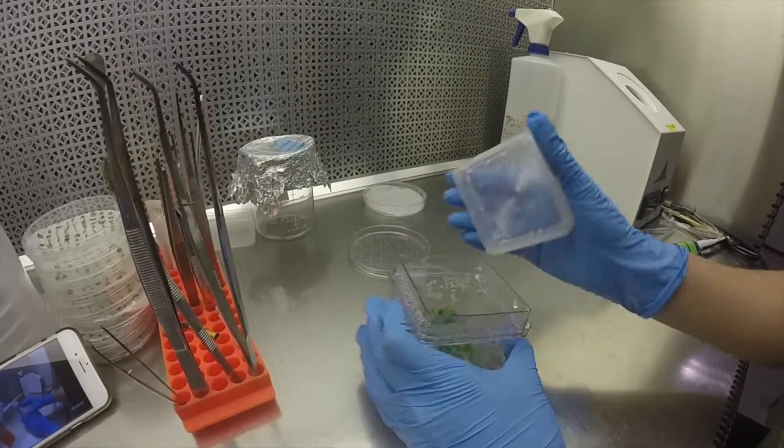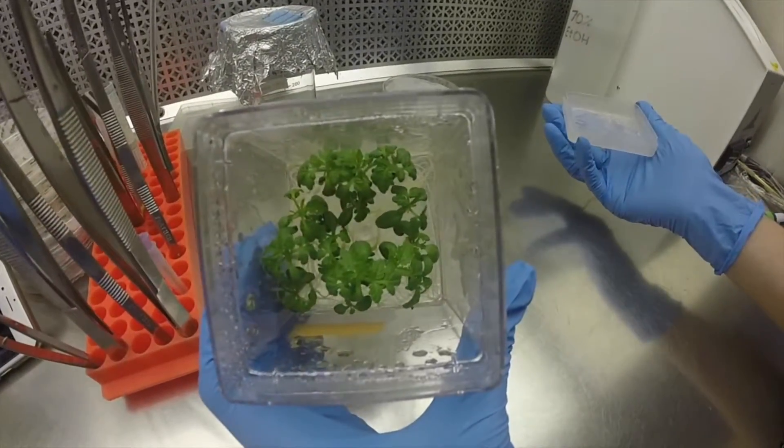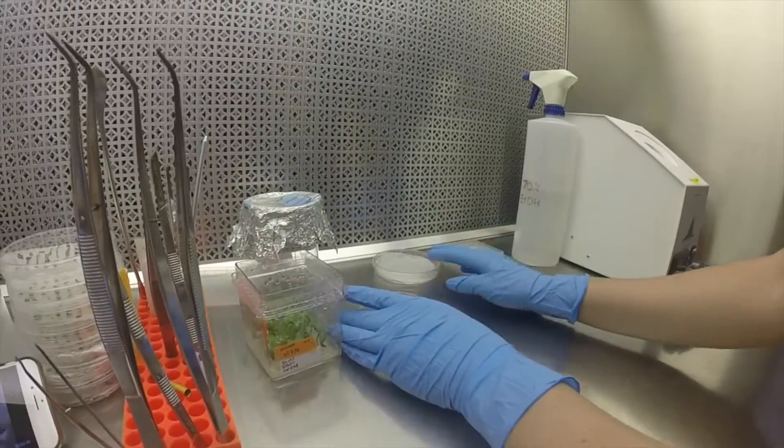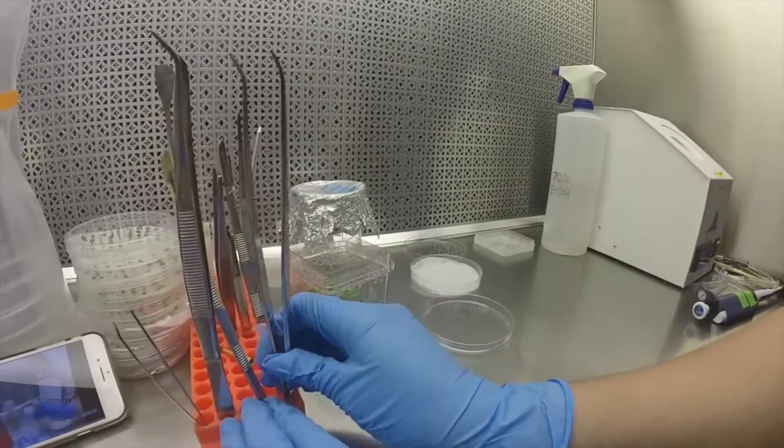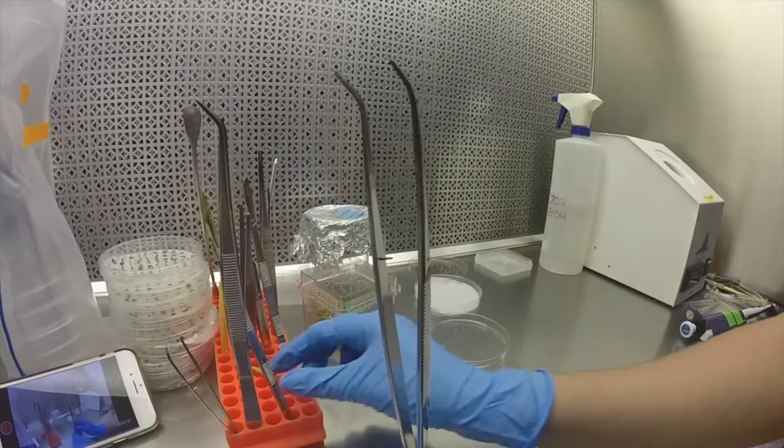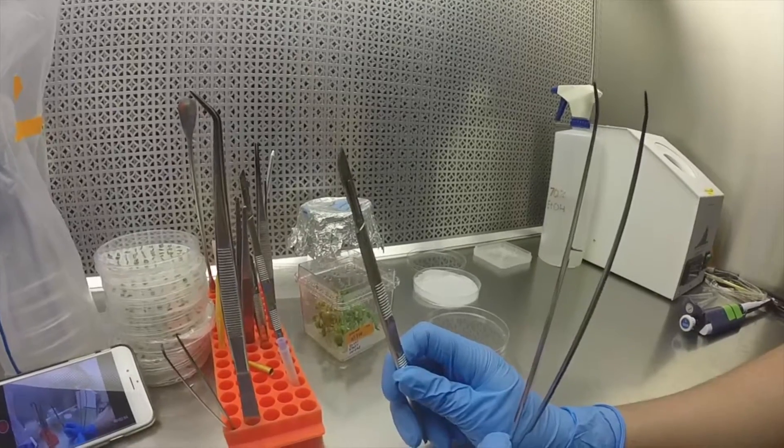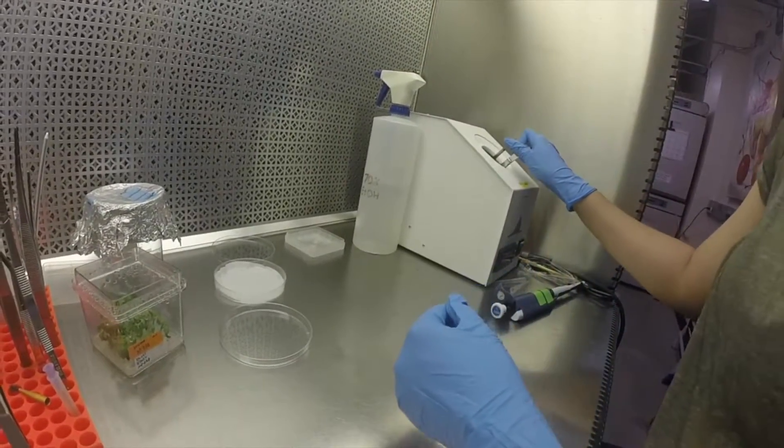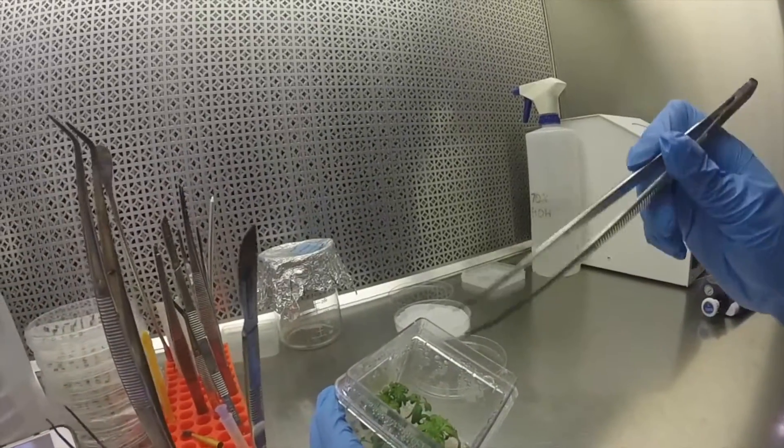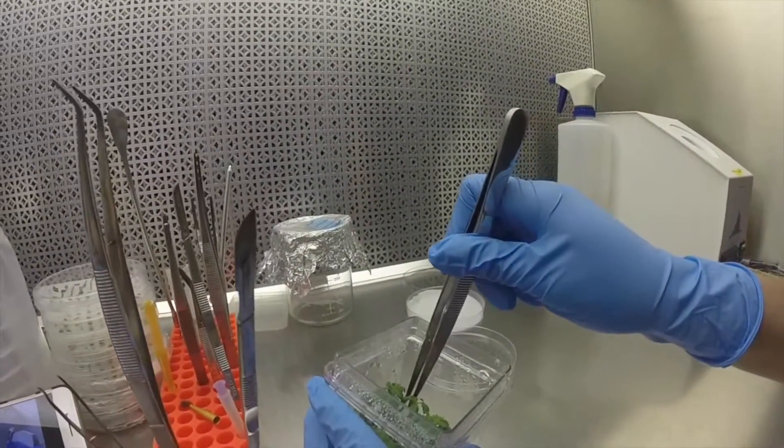From here we're going to open up our GA7. We're going to set it aside, open up our plate, grab our forceps and our scalpel blade, stick them in the bead sterilizer for 10 seconds before taking a couple plants out. We'll do them one at a time so they don't dry out.